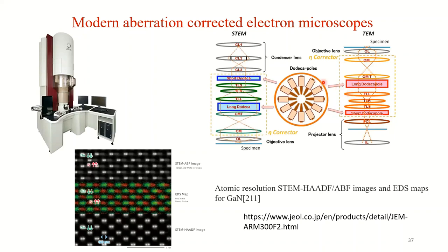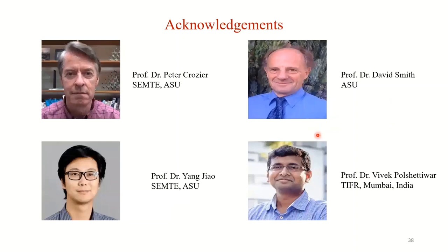And this transfer round lens corrects for the rotation, because your image in the TEM is often rotated. If you know the path of the electrons in the lens, they take a helical path. So your image is often rotated, and you have to correct for that too.